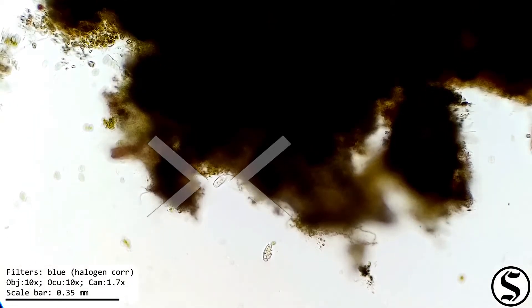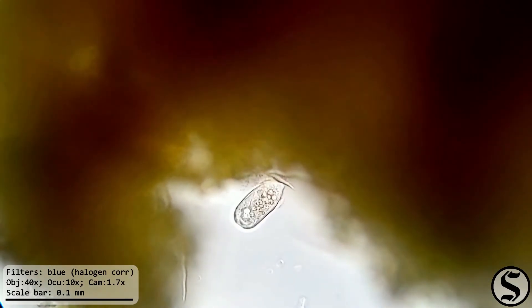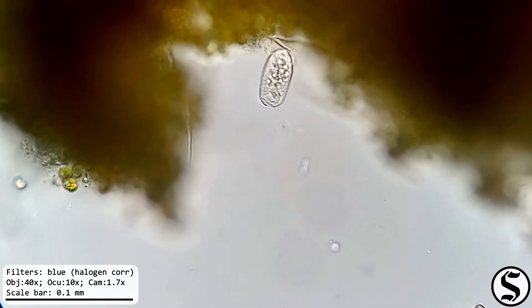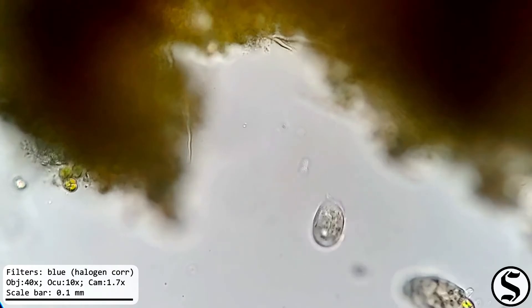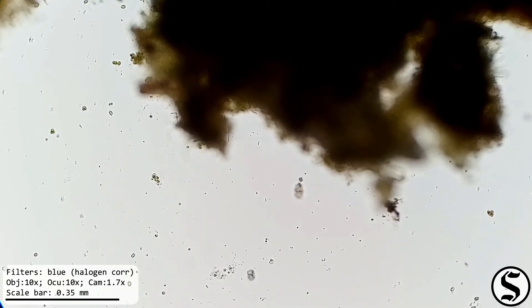And I thought this was very exciting. This here is a telotroch, from the Greek telos, end, and trochos, wheel. And the telotroch is a form of the Opercularia that's designed for travel. They can move around using those cilia on their heads, but by growing this ring, they can move more efficiently. As you can see, they're a little bit more spastic than the Opercularia just moving around with their head cilia.